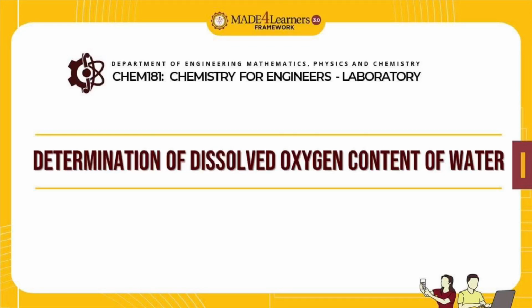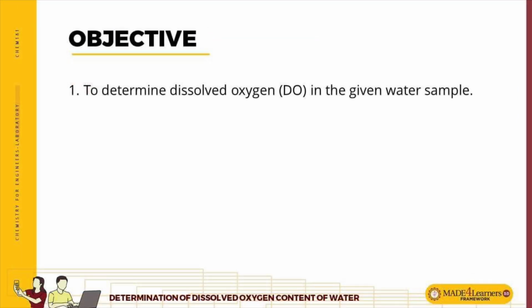Determination of the dissolved oxygen content of water. The objective of this experiment is to determine the dissolved oxygen content in the given water sample.